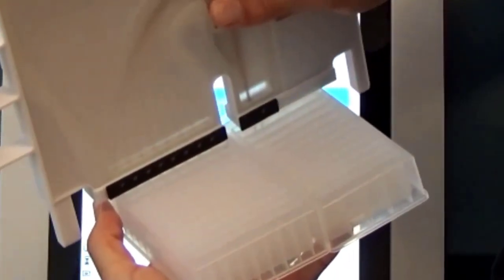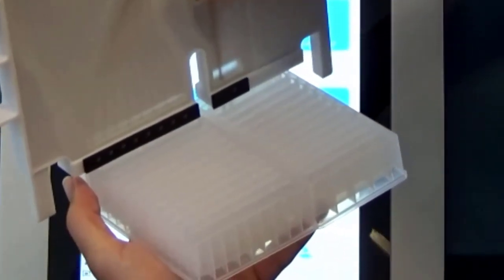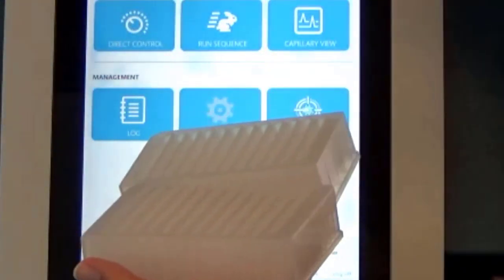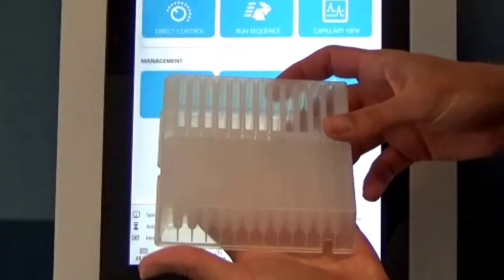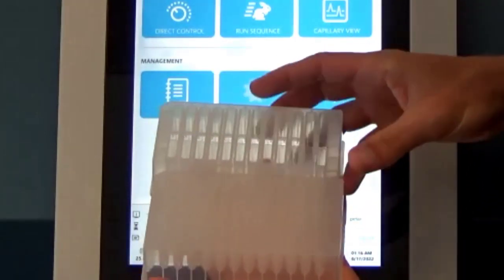And the capillary fits like that, right over the top. So it creates a nice pressure seal, allows you to do electrokinetic or voltage separations, also allows you to apply pressure for either the injection or for your rinse steps in between injections. And then over here, we have our sample plate as well as another outlet plate.